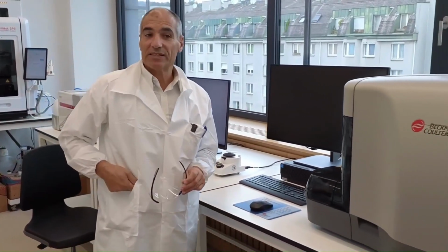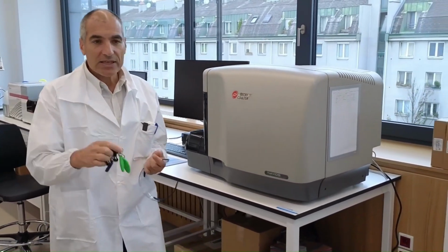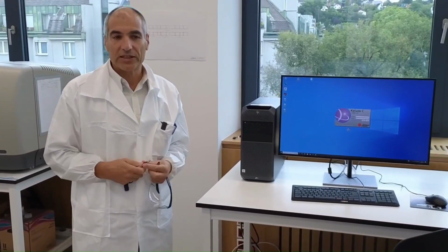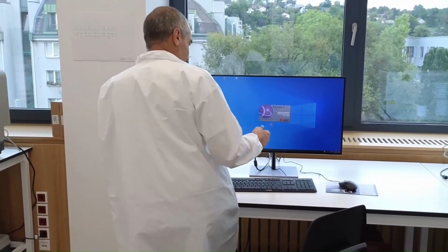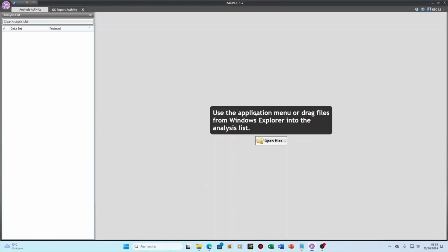From the Beckman Coulter website, you can download ClearLLab templates for QC control cells and data analysis and reports for Kaluza C. Kaluza C is available under a single license or network licenses and can be installed on offline computers dedicated to flow cytometry data analysis. It's part of the validated ClearLLab system workflow. So let's start Kaluza C.